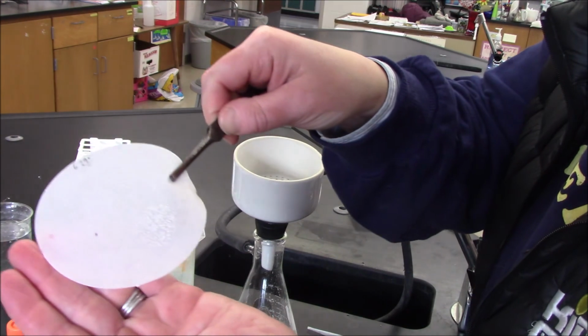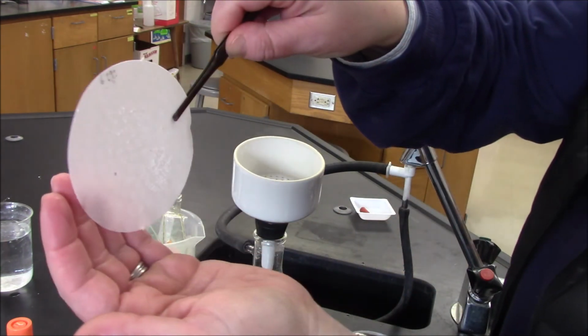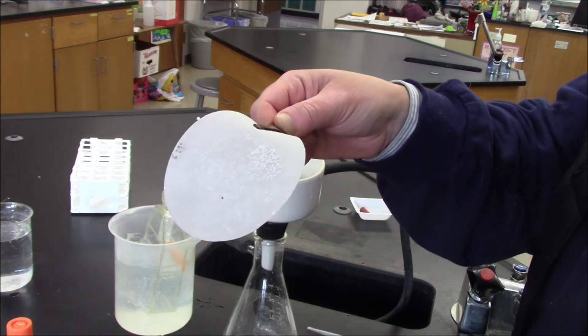All right. And then maybe if I hold it off to the side, I think you can start to see some crystals on it. So now I'm going to let it dry, and I'm going to do my melting point test.